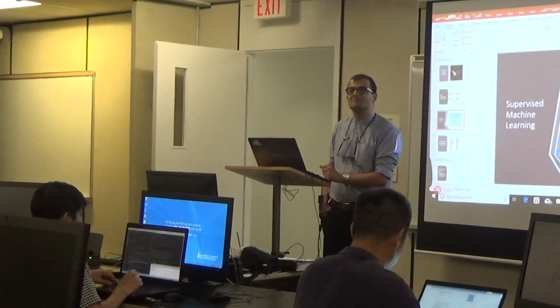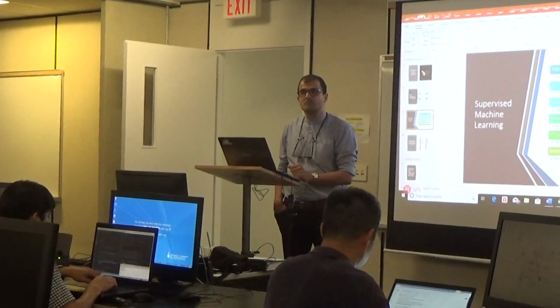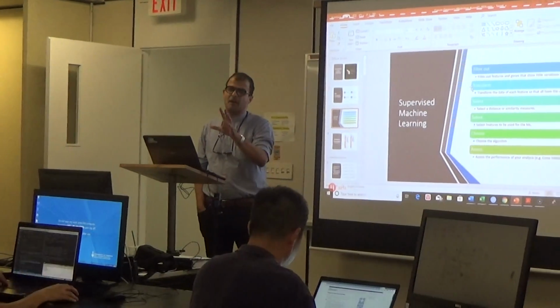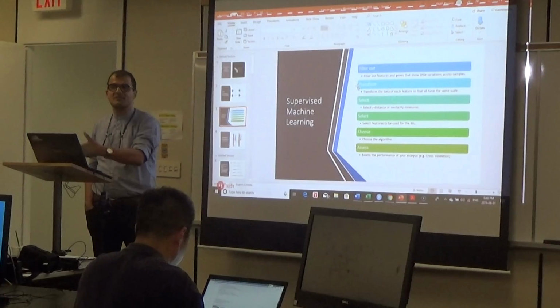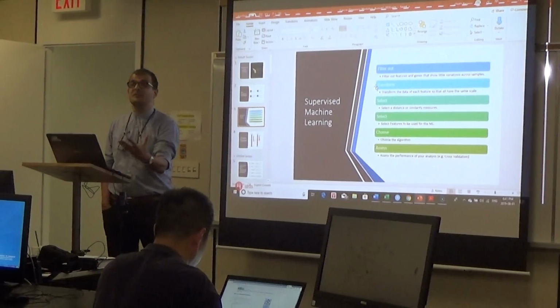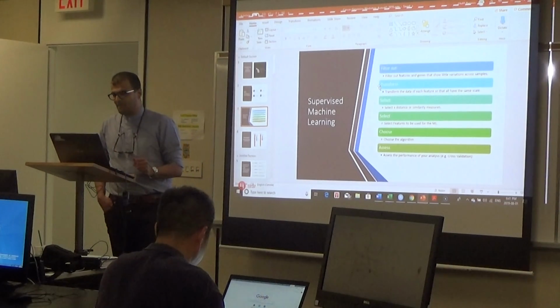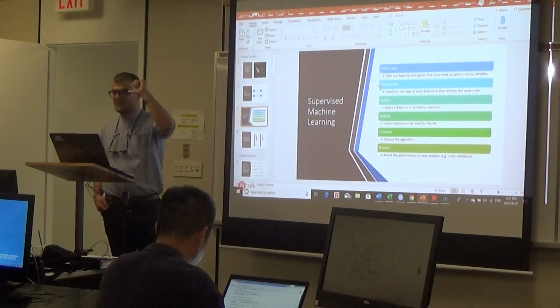Yes. Follow-up. So, if different microarrays have different chip types, do you have to install separate packages for that? It hasn't happened to me. It doesn't matter what kind of technology you use. The algorithm is, I should say, universal for any kind of technology. Okay. Now we are going to step number 2 to transform the data set.